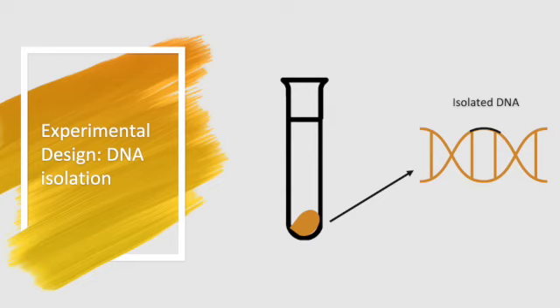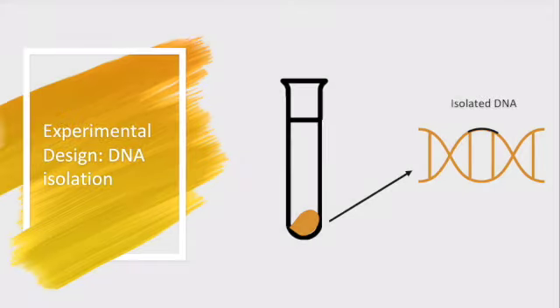When the phenol-chloroform isoamyl alcohol was added, we were able to wash the lysate by extracting the organic phase containing proteins from the lysate. After washing the lysate, we washed the DNA with ethanol. By doing this step, we were able to get clean, isolated DNA. Having the clean, isolated DNA ensures that our sample is free from as much cellular debris, such as protein, as possible.